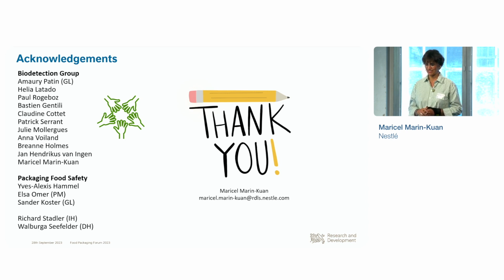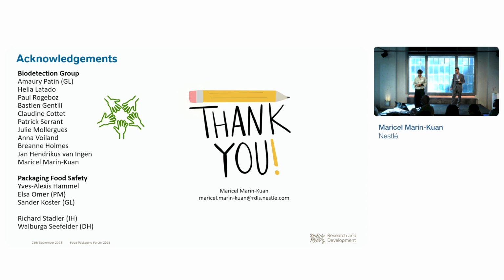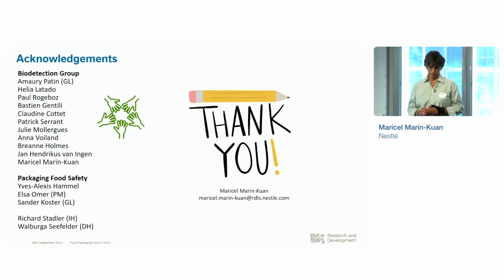Thank you. You're welcome. Do you believe the amount of time required to conduct these detection tests will decrease over time with newer technology and newer scientific discoveries? Sorry, I didn't get that. The speed of the testing. Yeah, this is the best part, because it's 3 hours instead of 24 hours for the incubation with the yeast and the bacteria. We saved a lot of time, and in 1 day we can have the results. And there is automation, and we can program it at night, and then you do the rest in half a day, if you would like.